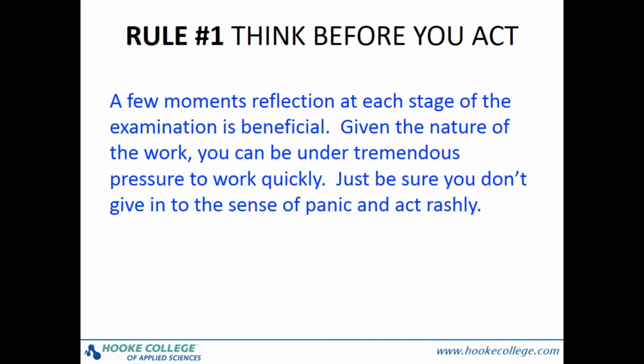It's said that Ansel Adams would spend up to 3 months planning how he was going to develop the film and print the image of his very best photographs. Well, you probably don't have that much time to think, but I do recommend taking a few minutes to work through the process you intend to take, how you plan to collect the sample, etc., before you even begin to do any type of analysis.